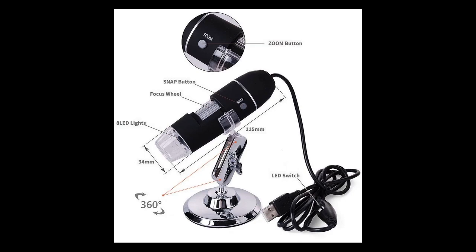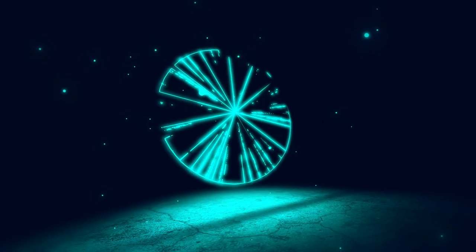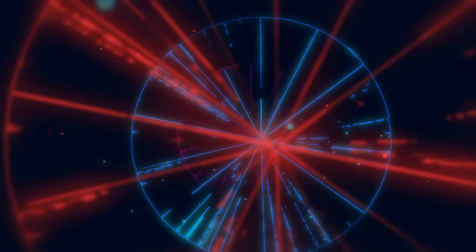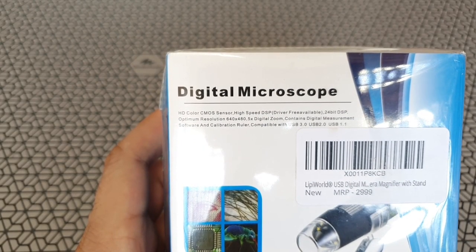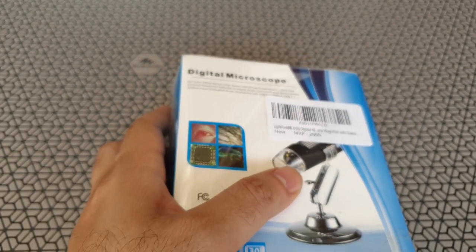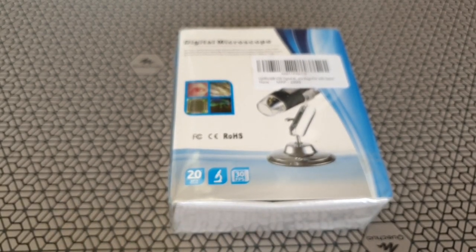Welcome back to Artec. Today we review the tiny digital microscope with 1000x magnification. Got this on Amazon for about 1500 rupees and it comes in a neat blue themed box. You would have seen these kind of microscopes online — they come under various brand names but look the same. This one is called Lippy World USB microscope with 1000x magnification.